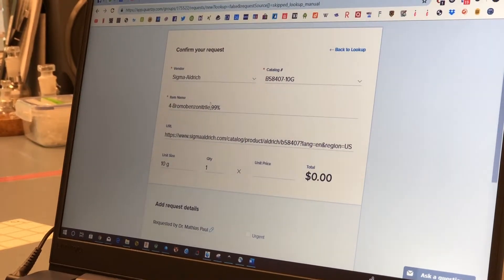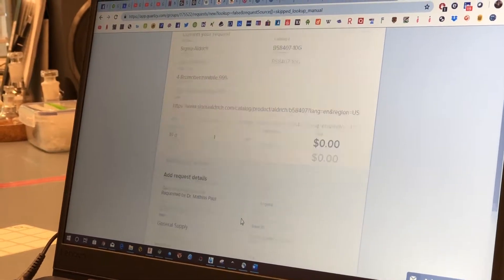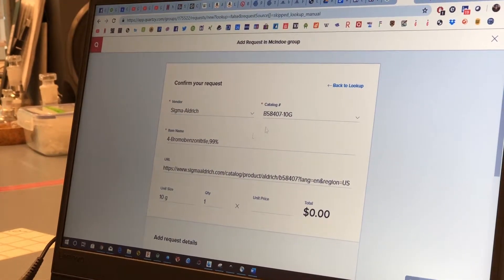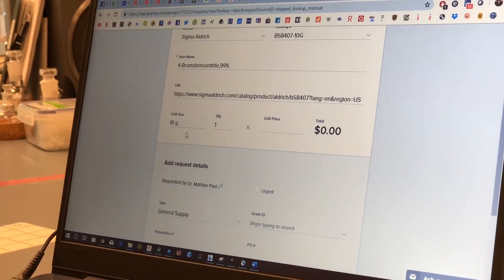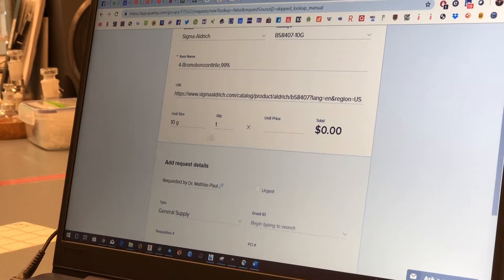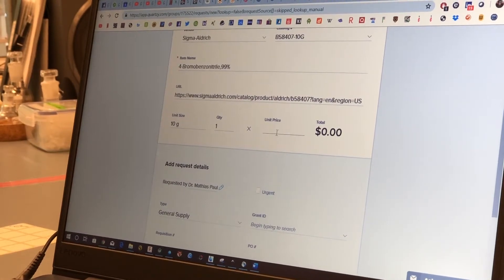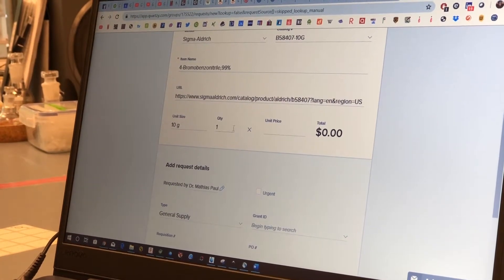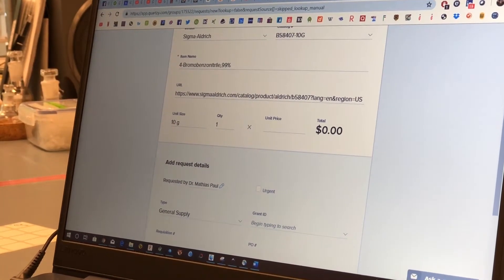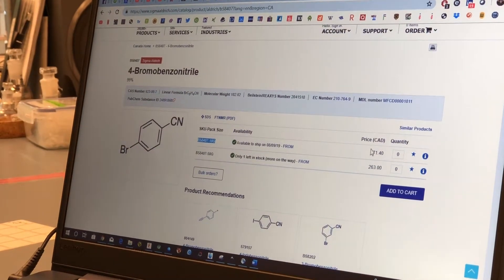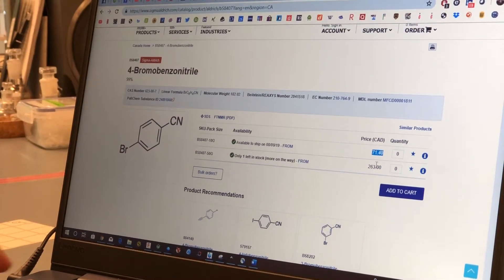So a lot of the things that you need are already in here as the catalog number, name, and so on. Please double-check if you have all the right amounts and quantity. You have to put in the pricing yourself so you can just copy that from here.